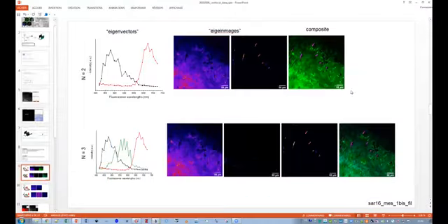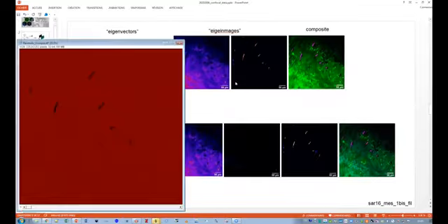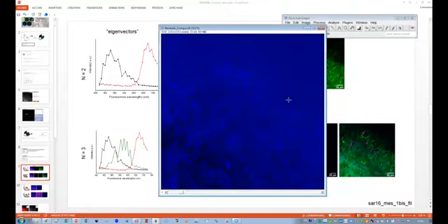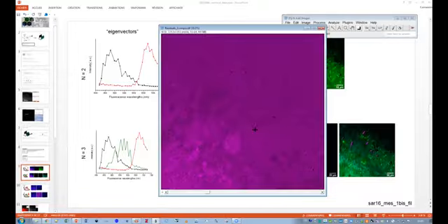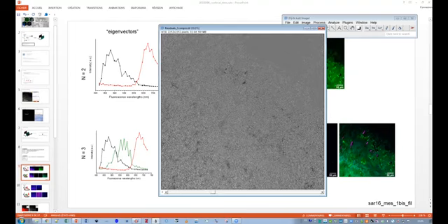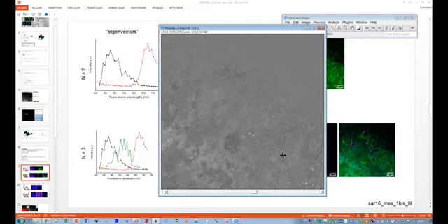For instance, I have my residual here for 2 compounds. And you see, normally the residual is in white. It was for 2 compounds, so this white zone remains.